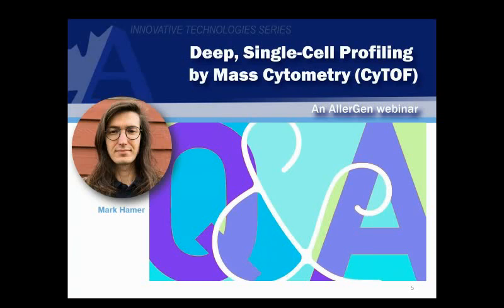That's it for me. All right, well, Chris Carlson is chipping in again with a couple of questions, so I'll read those out. Let's say your main questions involve traditional cells, for example, just all PMNs, but also interested in rare cells. How does CyTOF compare to traditional flow for the traditional bread and butter cells?